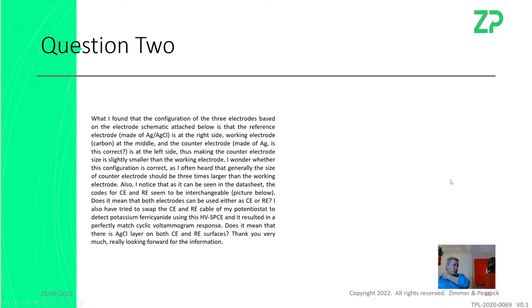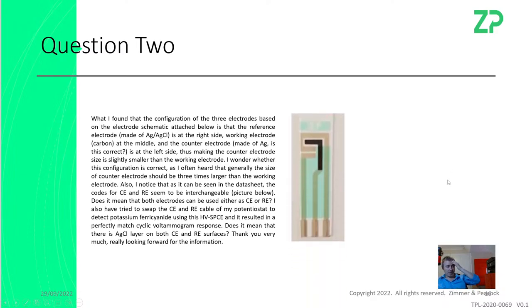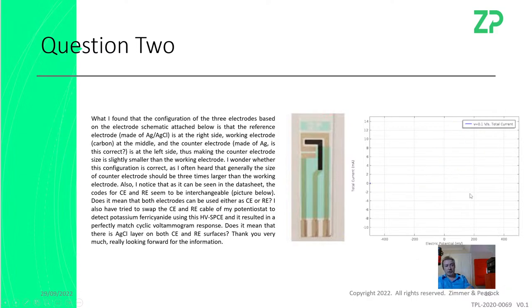Question number two: somebody also has one of our hypervalue electrodes. They look like this. I think they're really quite good. They're doing a ferricyanide cyclic voltammetry on it, and they've noticed that we often use this one as the reference and this one as the counter, but by swapping these, it makes no difference to the voltammogram.